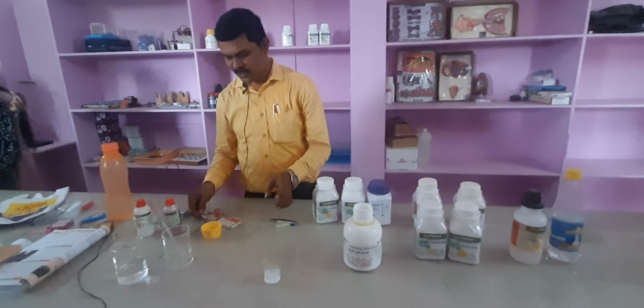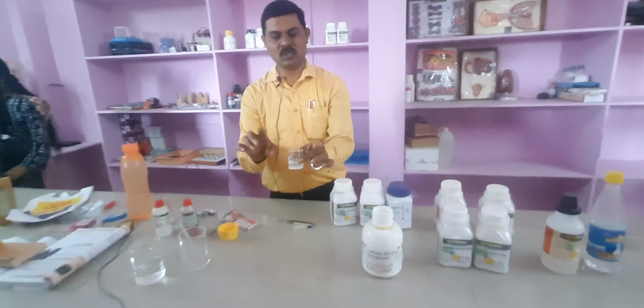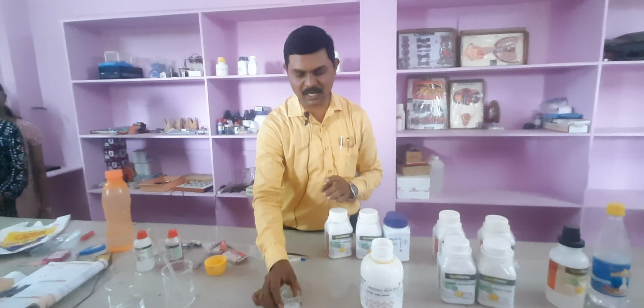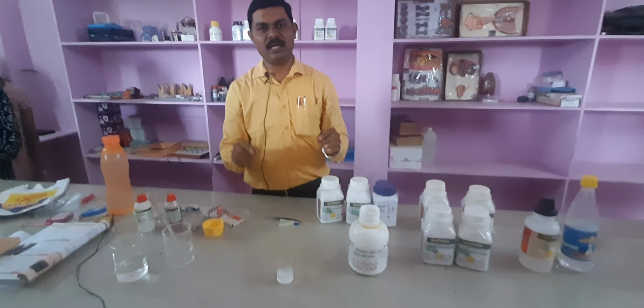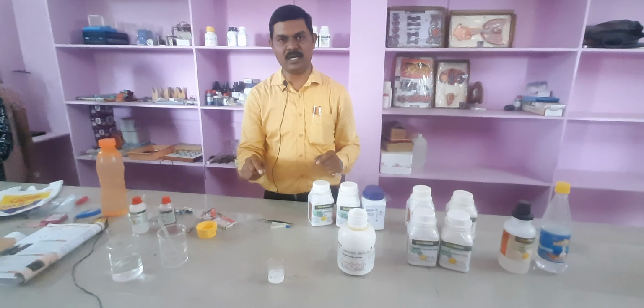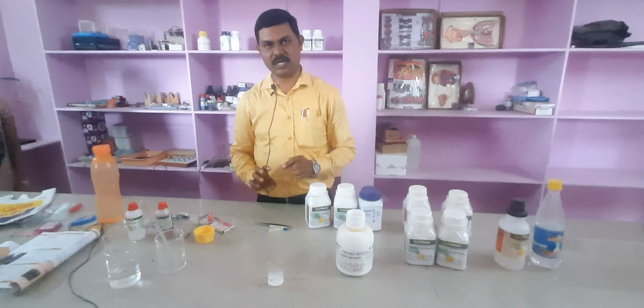And one more thing, if you touch the glass beaker, it is a little hot. So this is also an exothermic reaction. You already know exothermic reactions. Any chemical reaction in which heat energy is liberated is known as an exothermic reaction. So this is one of the exothermic reactions.